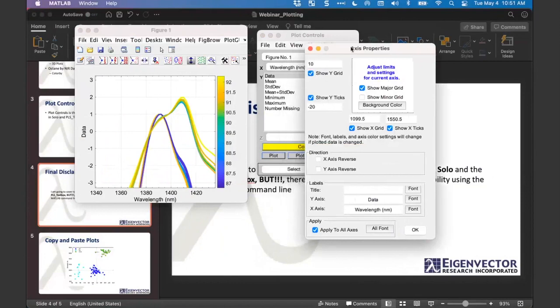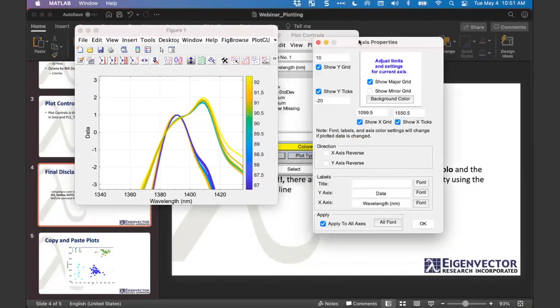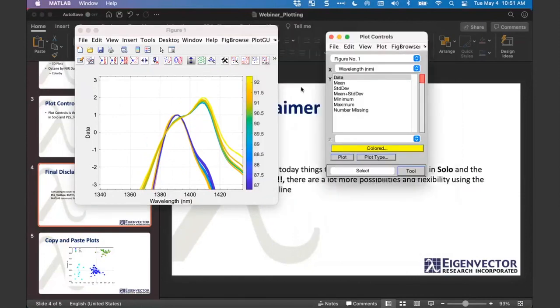And the question is, is it possible to add a text box near the color map and rotate it 90 degrees? I believe the answer to that is yes, you can add text to a plot. I don't know if you were prepared to show that one. I know our Neil Gallagher does that all the time. Neil, do you want to tell us how you do that?